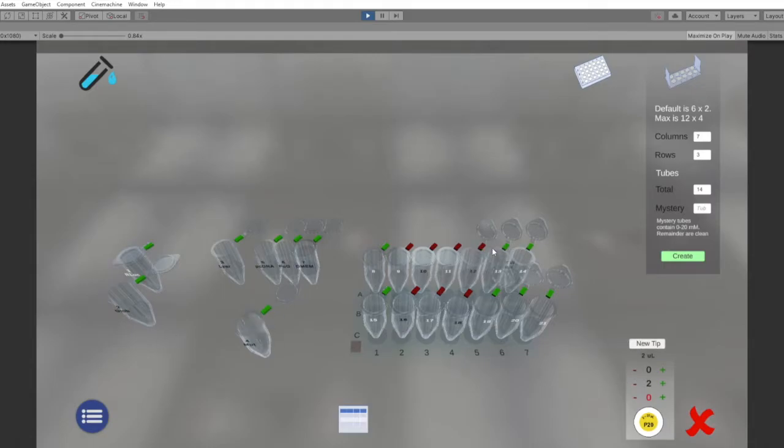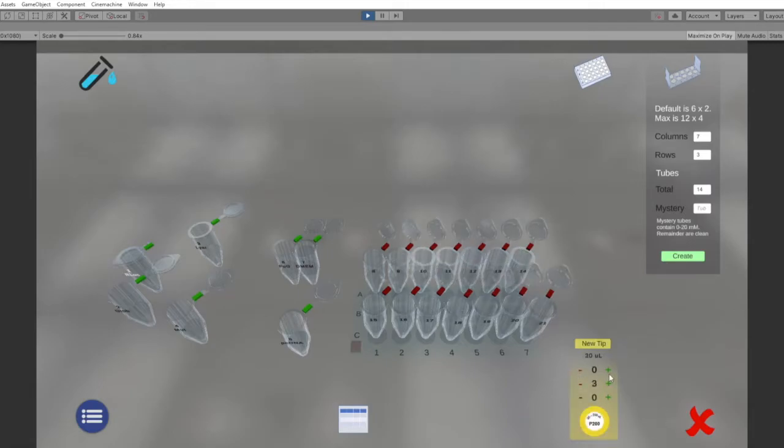Now I'm going to put the mutant globin into the last 3 tubes in each sequence, and then having done that, we'll close the lids again and we'll get going with the next addition. So basically going through the additions as in the table, opening lids, closing lids as we go, changing the volumes, finally ending up with the DMEM, which I should have put in first, the 42 microliters of the DMEM, and eventually that all goes in and we close all the lids.